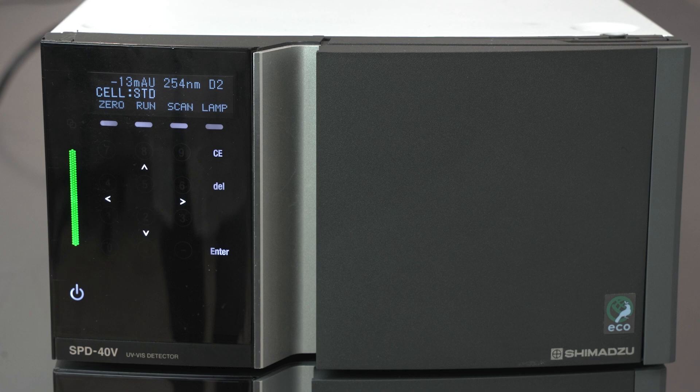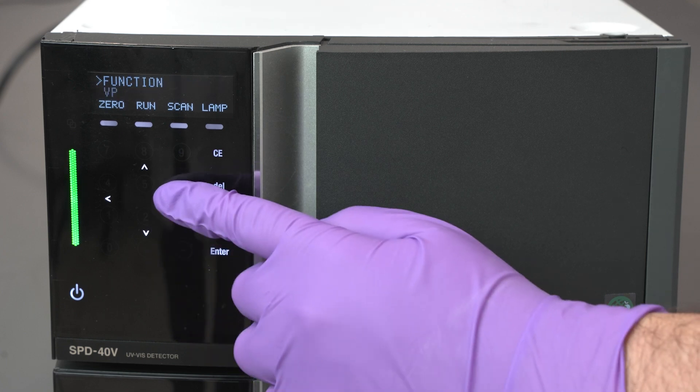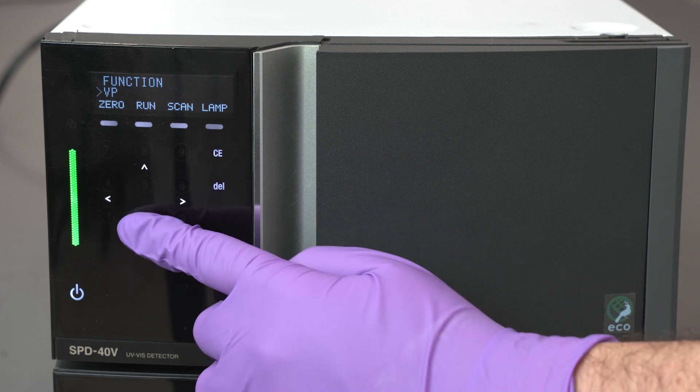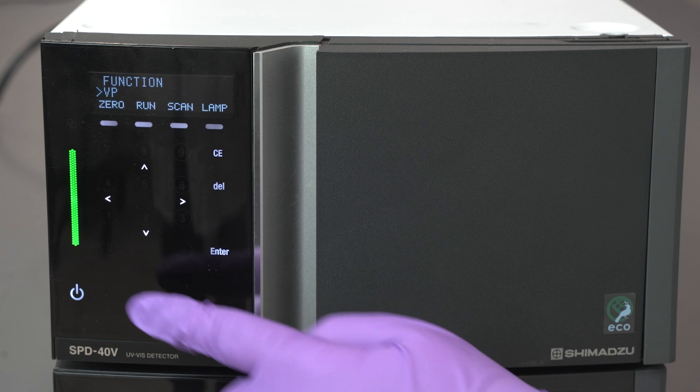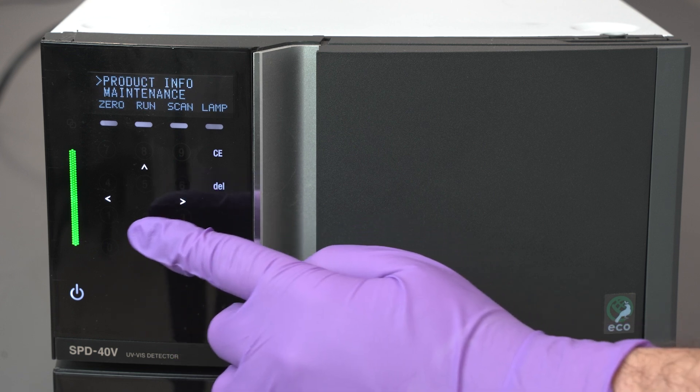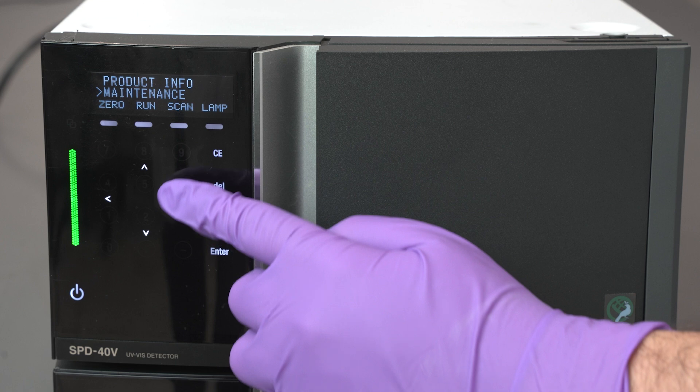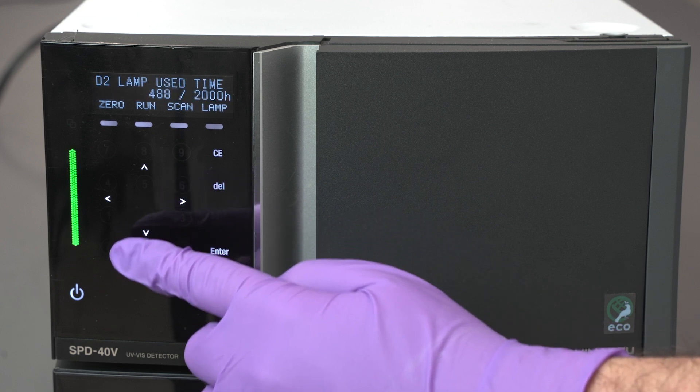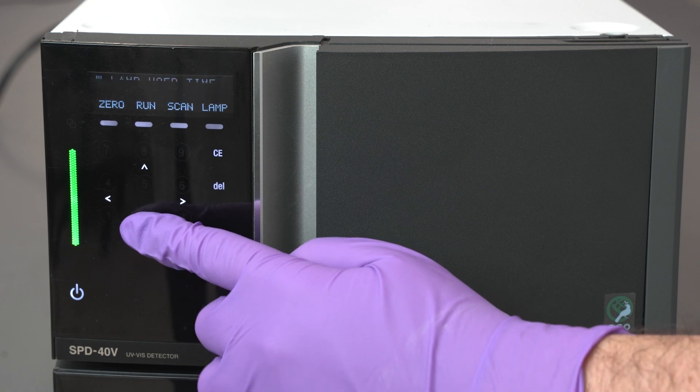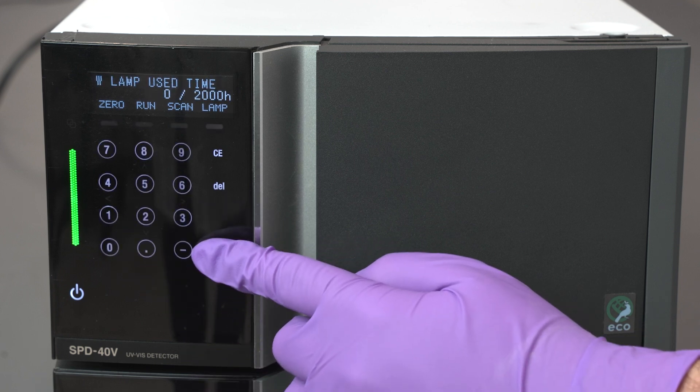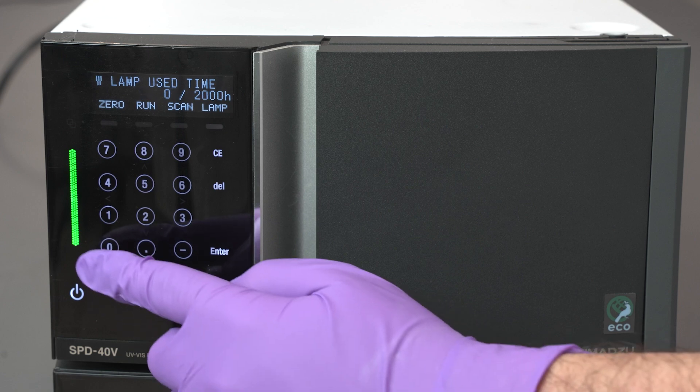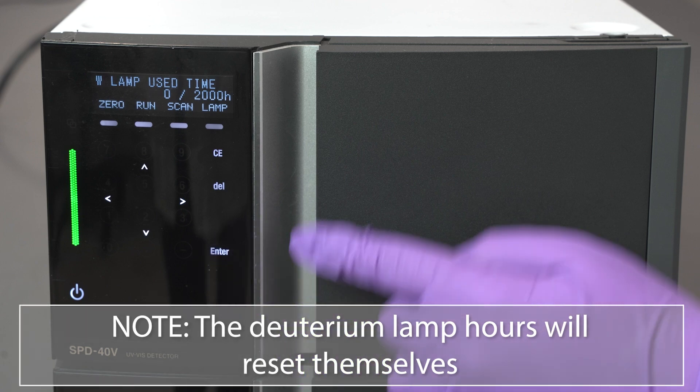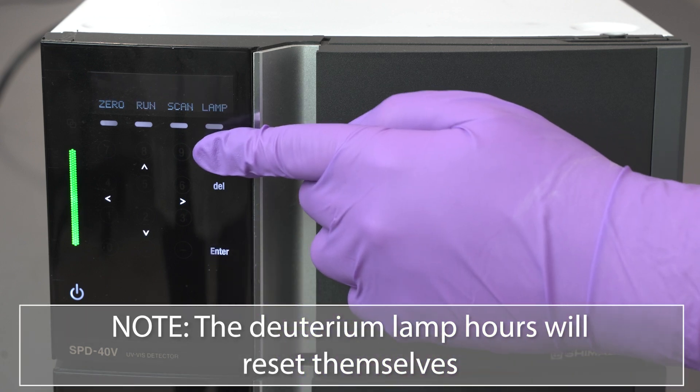On the detector front panel, press the right arrow where you will see function and VP. Press the down arrow to highlight VP before pressing the right arrow to open the VP menu. Press the down arrow until you see maintenance. Press the right arrow to open maintenance menu when it is highlighted. Press the down arrow until you see W lamp use time. Press enter, then zero, then enter again to reset the time. Note that the deuterium lamp hours will reset themselves.